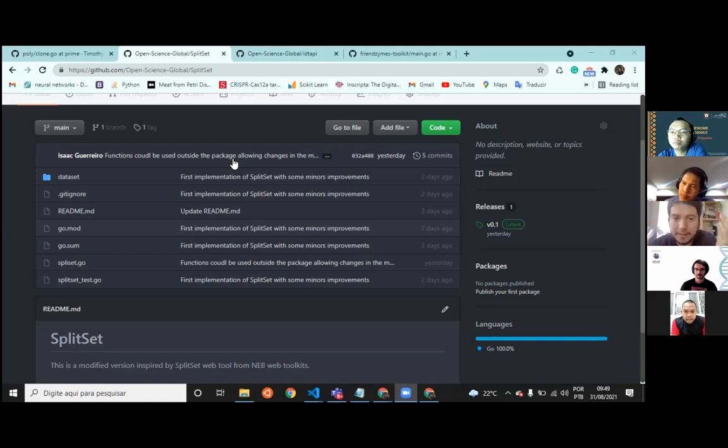So let's say that Philippines is actually making ligation for 4 enzymes. The final product will be the OpenTron using the linearized plasmid for each enzyme in a specific flask. The final result will be the ligation occurring in each flask, in 4 flasks, one for each enzyme. Okay. So right now after the ligation, we run the gel again, and you could see that we now have a plasmid circularized, right?